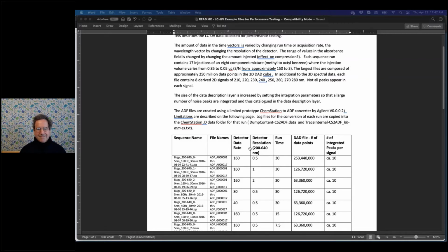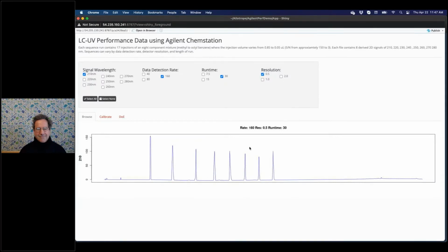In order to make the exploration of this data more user-friendly, as well as to highlight the interoperability of our system, we designed a simple GUI using R and R-Shiny. This application talks to SciDB using the SciDB R API that we developed. Almost all the queries that I'll show are being done on the fly. There's no caching or indexing. I haven't run these queries before.